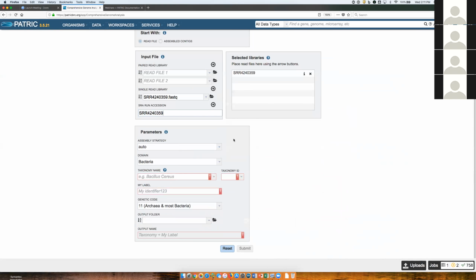Okay, so PATRIC has a number of assembly strategies that you can use. When you choose the auto assembly, it runs 3 different assembly algorithms at the same time: Spades, Velvet, and IDBA. It will run all 3, and then it'll choose the best assembly. We also have Fast, Full Spades, Kiki, MiSeq, Plasmid, which is fast, which is Spades, sorry, and Smart, which is one we use for PacBio. Well, let's just use the auto assembly method right now.